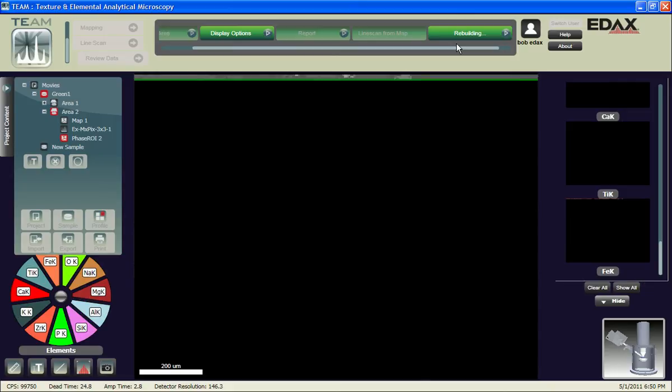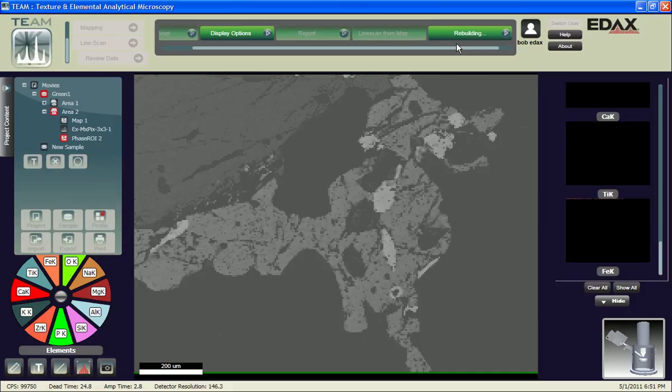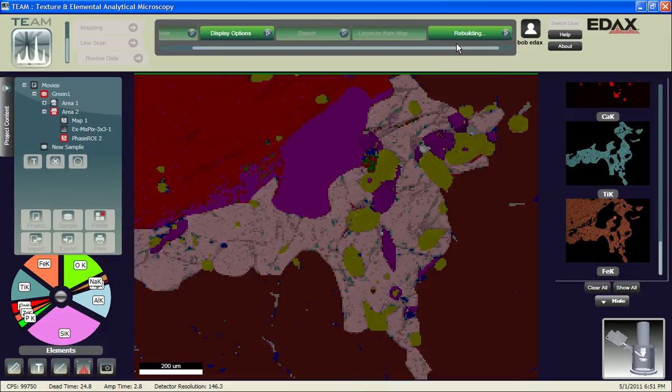And then what's happening now is you see that the image starts to come down, and it comes down pretty slowly. I think it's going to be a little over a minute on most systems. It'll be a little slower here if I let it go. So I'm going to pause the recording, which would make it speed up a little bit. Okay, now it's almost done with this first pass where it's just loading in the data. And now it's going to fairly quickly go through a series of passes here, trying to clean up the data a little bit.